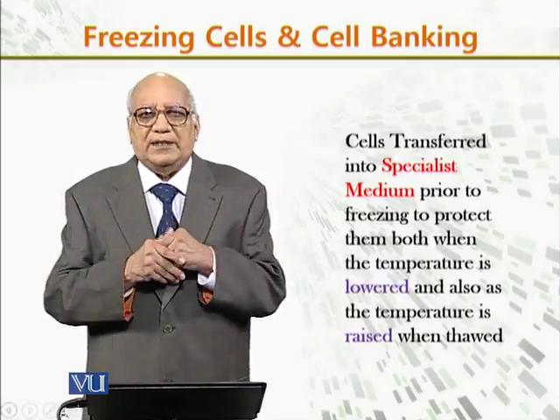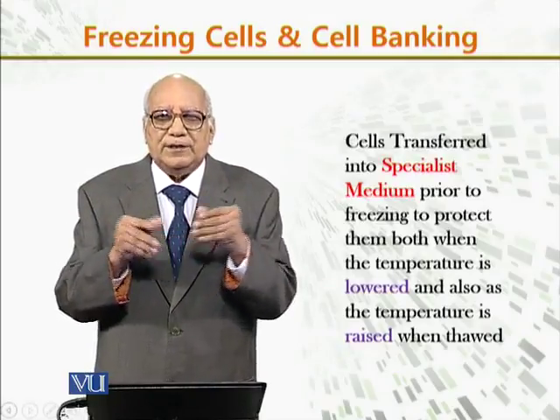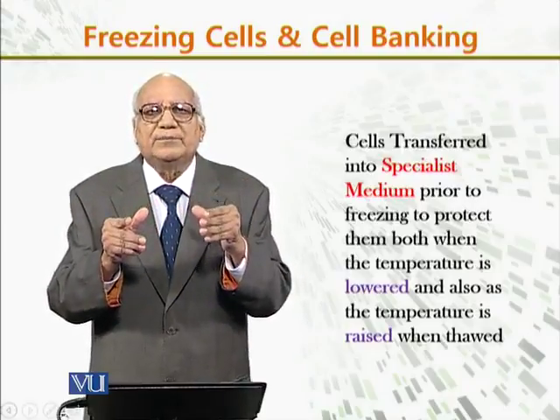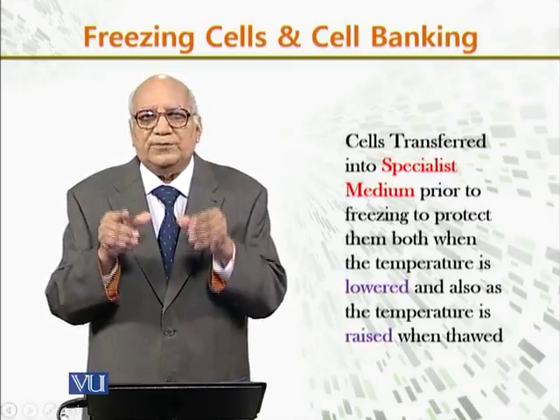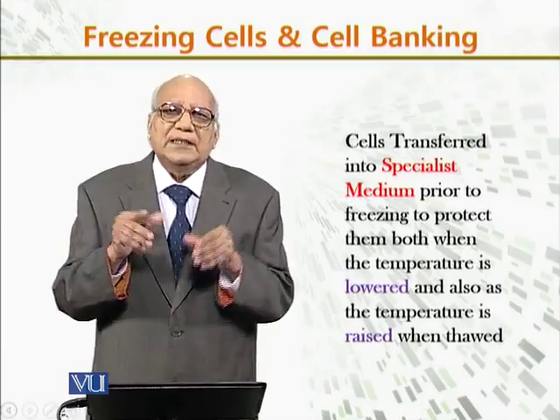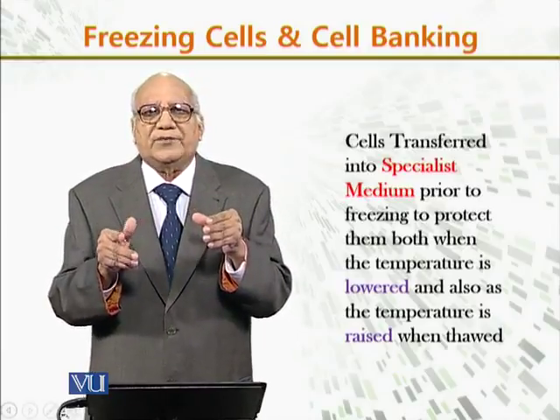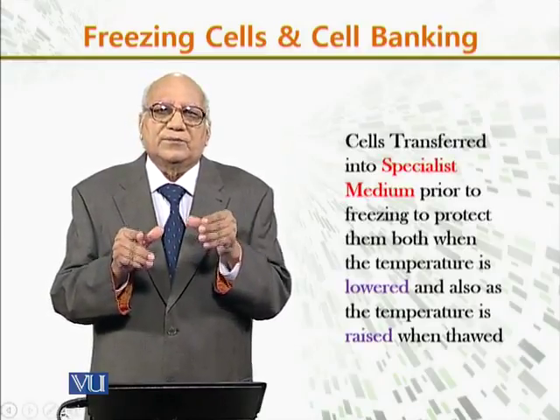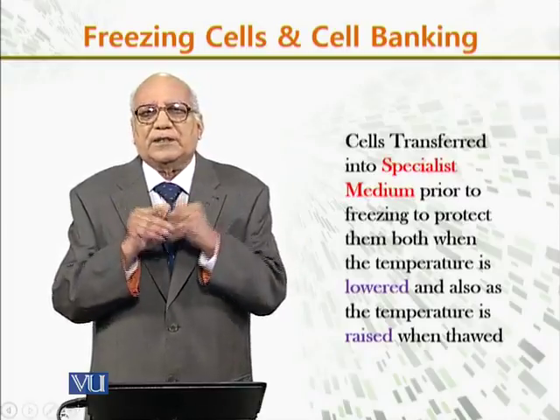Imagine the cells are taken and first put into a special medium prior to freezing. This is very important, because if we don't do this, we will damage the cell structure, and we won't be able to utilize the cells again after time.